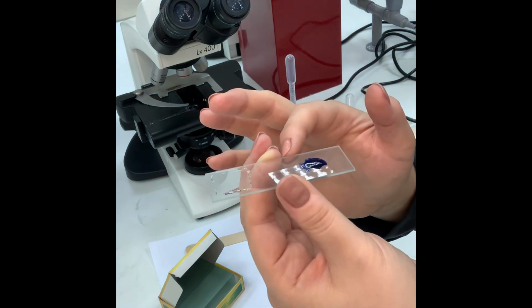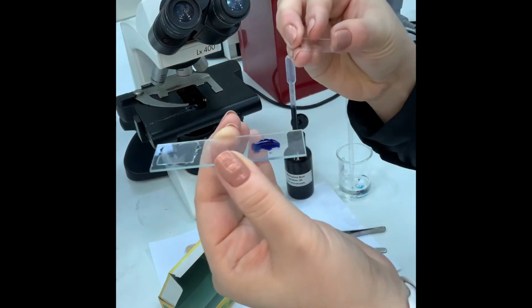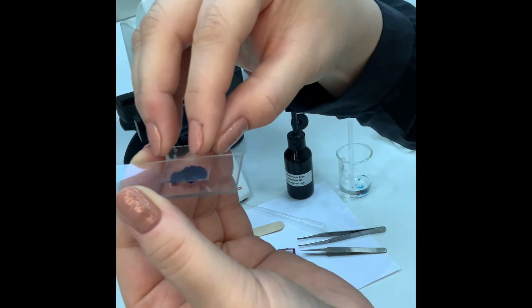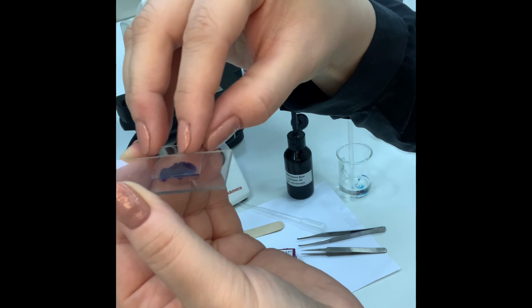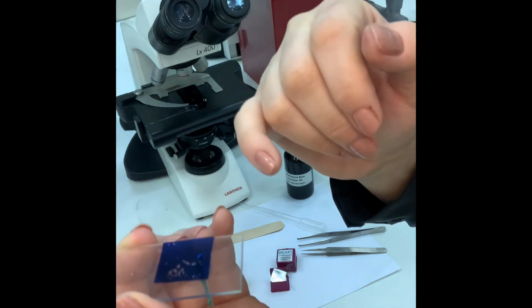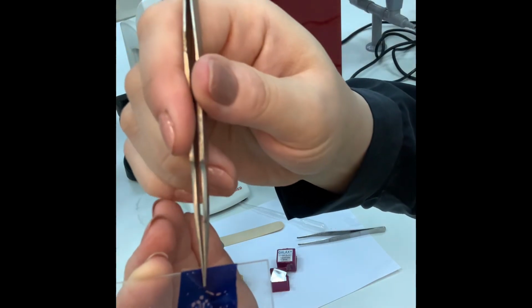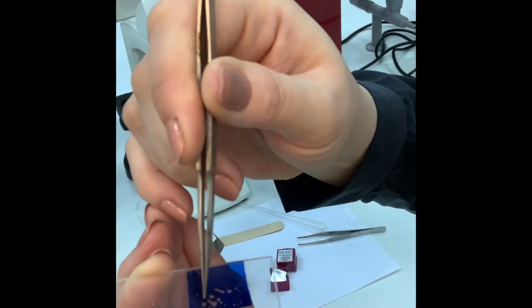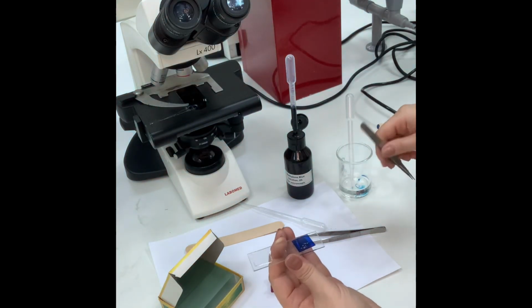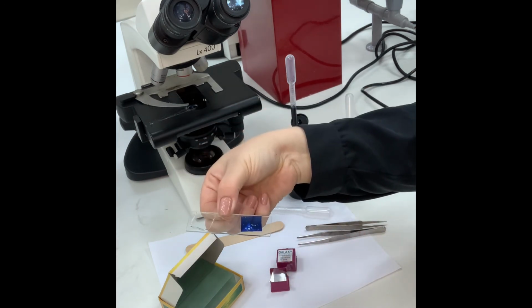And the same for the stain, I'll just do it again. So I will tilt, see, I will touch the sample over here. See, this is the air bubbles I'm talking about. You will simply try to tap, follow it. Of course, I need to do it on the surface of the table. And this is the cheek cell sample. Very simple.